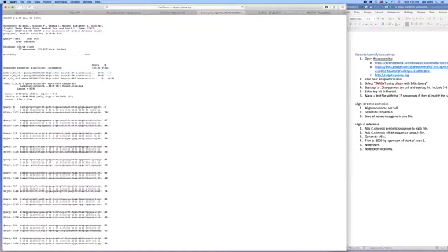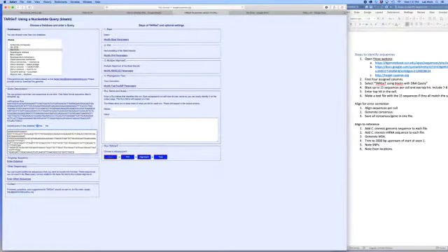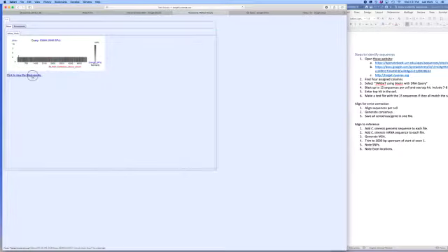So here's the output from the first one that I did. That one was a forward sequence to begin with, and you look, the query goes from 1332 to 1338, so it's increasing in numbers. So the query is going in the same direction as the subject, so it's the forward sequence. Okay, and so you can simply click the back button, delete all that, paste in the new sequence, run the blast, and we'll take a look.